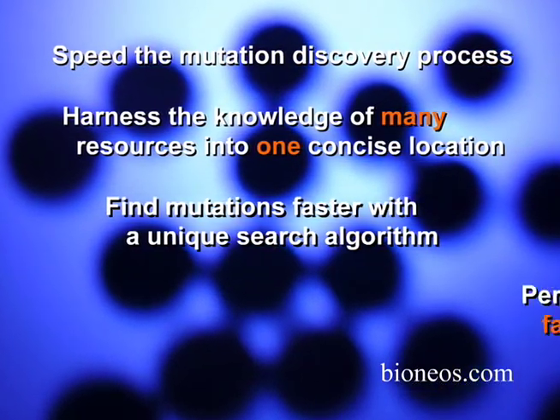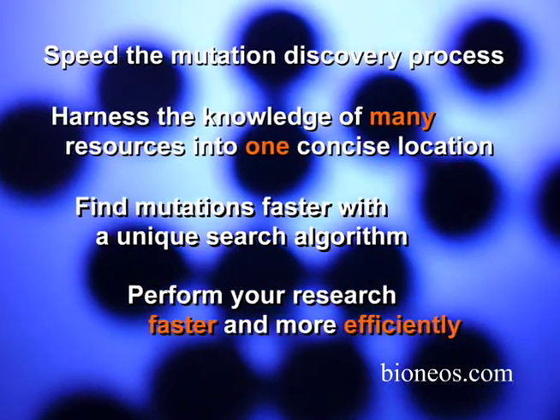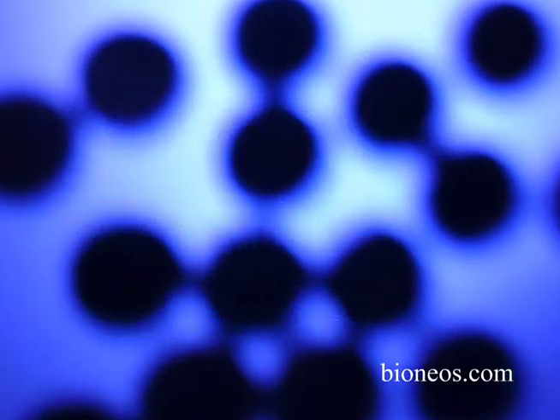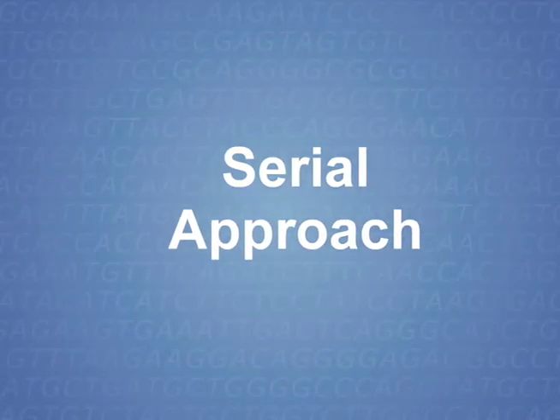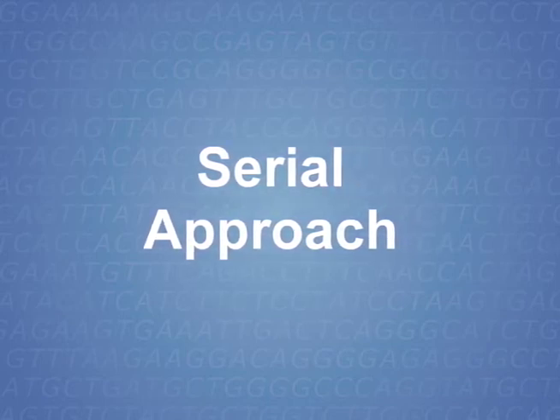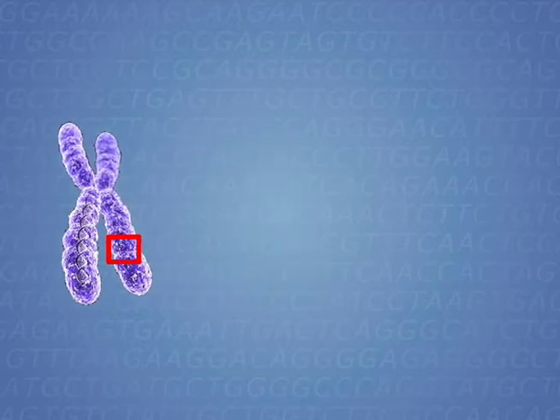you need to perform your research faster and more efficiently. Before showing you the application, let's first explore the unique search algorithm that sets Biopod apart from any software you've seen. When searching for novel mutations, investigators typically use what we call the serial approach to designing PCR-based experiments.